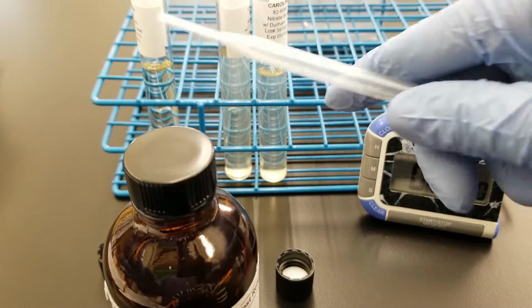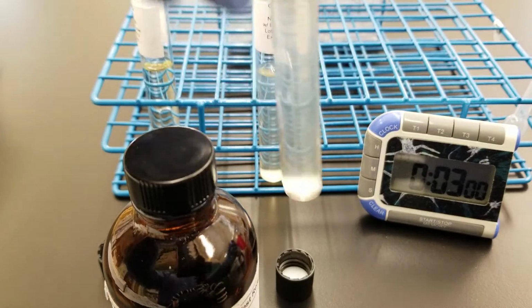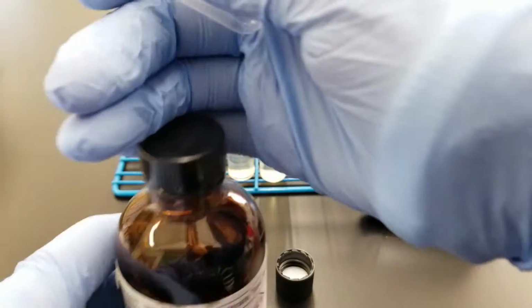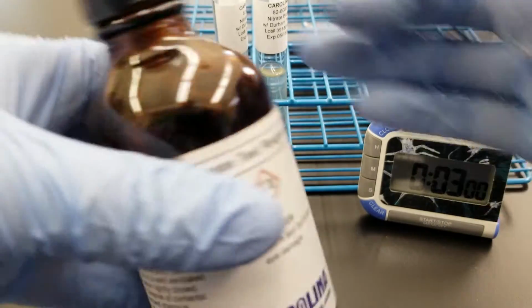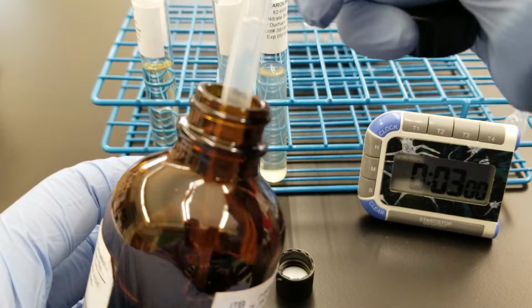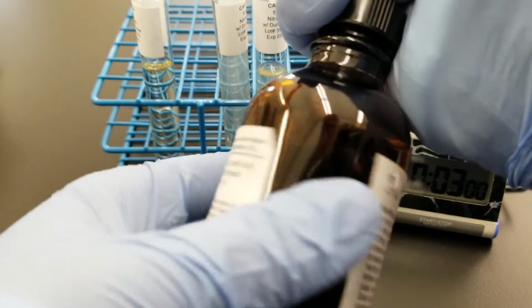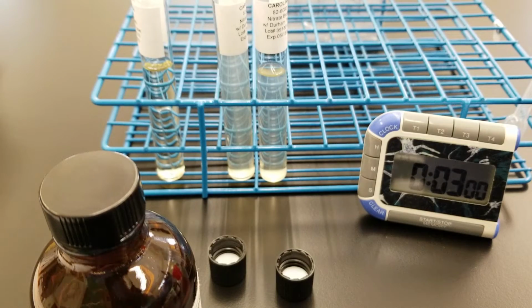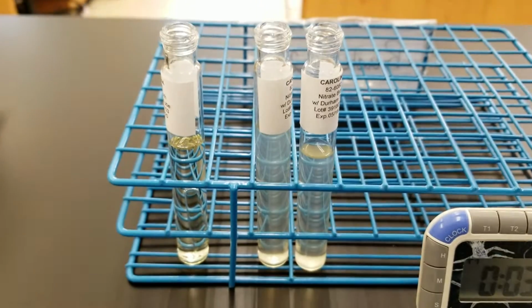All right, so I have all of them uncapped. You can use the same pipette as long as you don't touch the mouth of any of these tubes, okay? And you don't take it down into the actual tube. So we're going to swirl. Remember, this is a health hazard, so you want to keep it uncapped as little as possible. So I'm going to pull some up. We're going to do 5 drops in all of them, okay? It can also be 0.5 mL, but I'm going to do the drops. So let's see if we can, there we go.